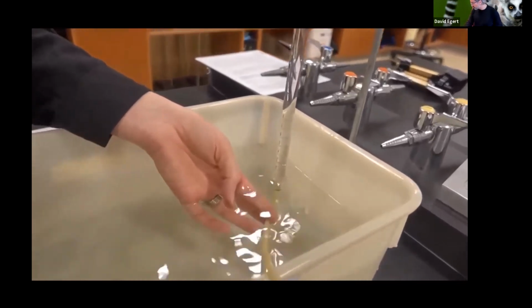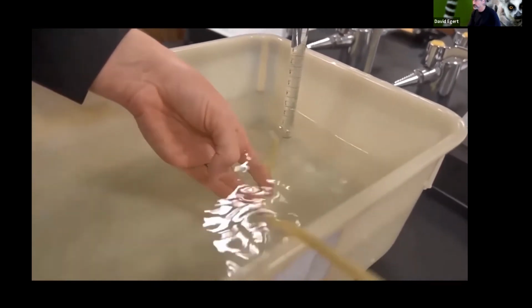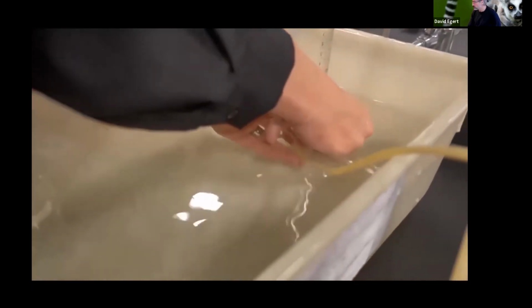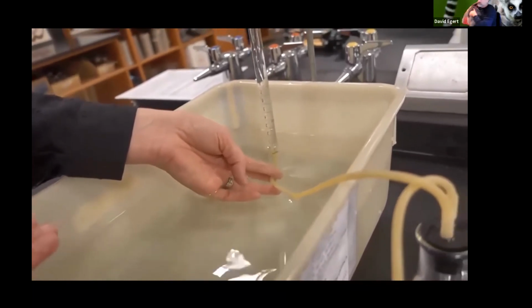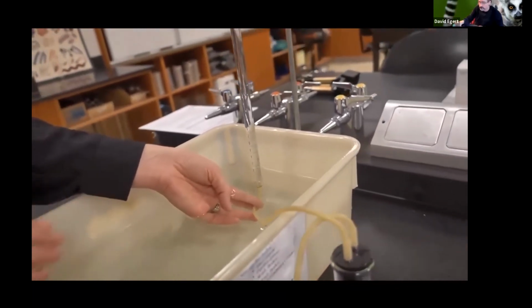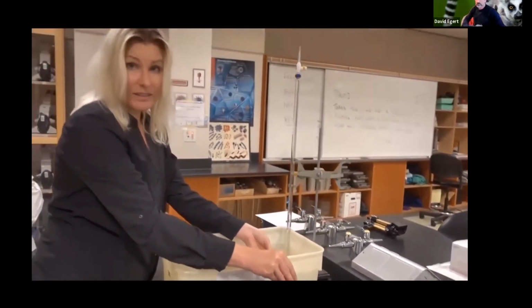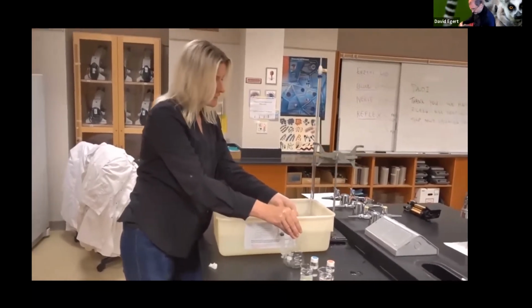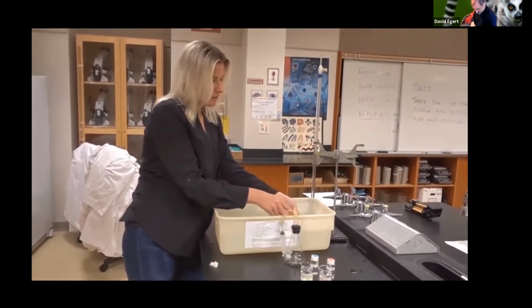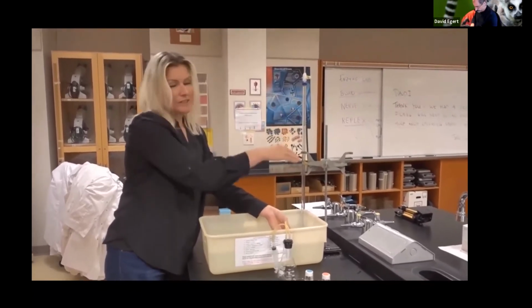It's kind of key that you also make sure that you don't have it accidentally slip out during the experiment. But if it does, remember, this is a super fast experiment. You can just redo the trial. During the experiment, one person is going to agitate this. We keep the reaction going and everything is mixed nicely. Then oxygen is going to form and start bubbling here, displacing the water.